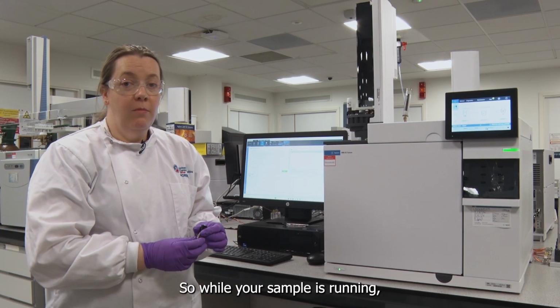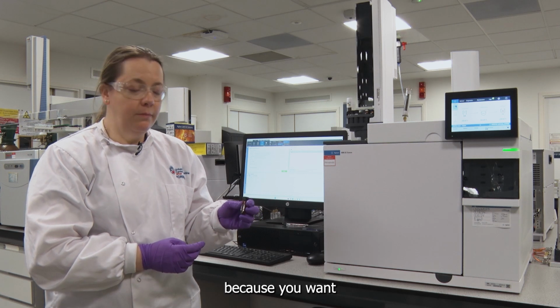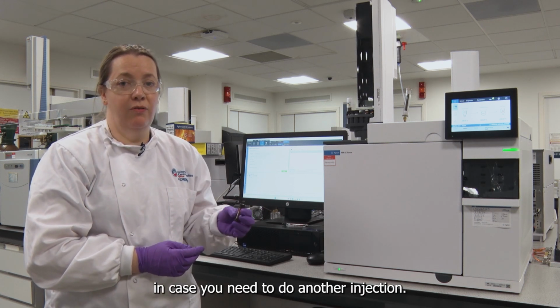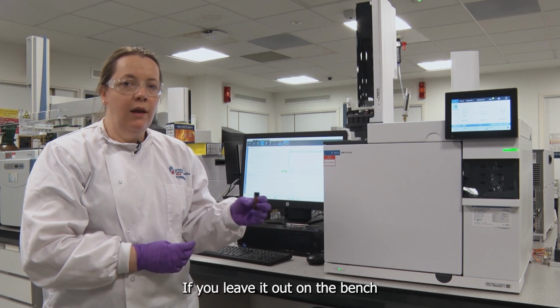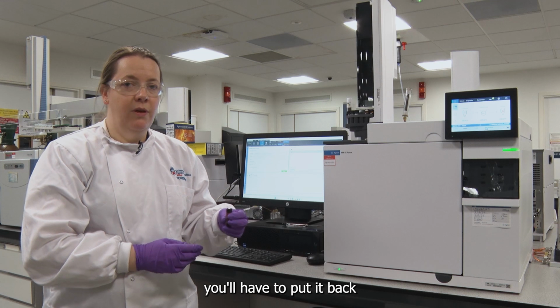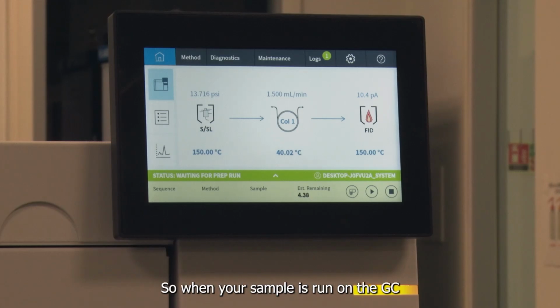So while your sample's running, put your sample back in the water bath, because you want to keep the equilibrium established in case you need to do another injection. If you leave it out on the bench for any amount of time, you'll have to put it back for the full equilibration time.